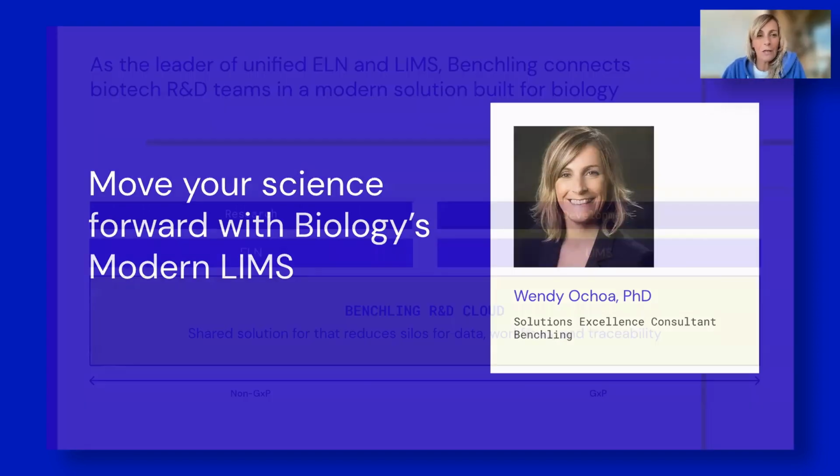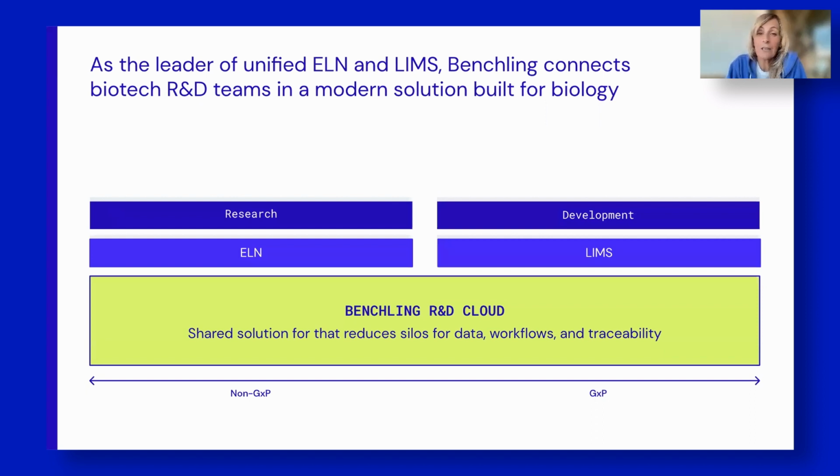Hi, my name is Wendy Ochoa, and I'm very excited to be able to share how powerful Benchling is for both research and development. I will be sharing information about Benchling LIMS capabilities today. I will highlight how our new workflows application now allows the team to design and execute complex processes using the shared scientific data you are currently generating in Benchling.